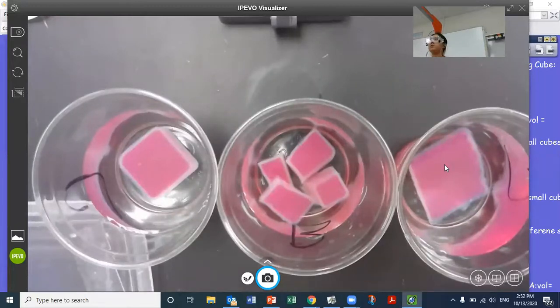So if you are going to wait, I will include time points inside of the post to tell you at what points we actually collect the data for the distance of the white diffusion. Actually, I think I can just record separate ones. Yeah, I'll just record separate videos at the different time points, and we'll take the data at each time point.